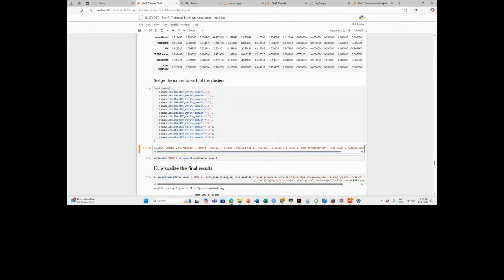And I see that we also have another question. Did I answer your question? Yes, thank you. So it's important to maintain the same order because maybe we can assign a different name for our respective cluster, right? Exactly. So in this case, we get an order, and it's harder to make mistakes.